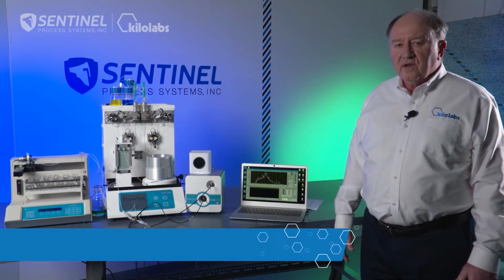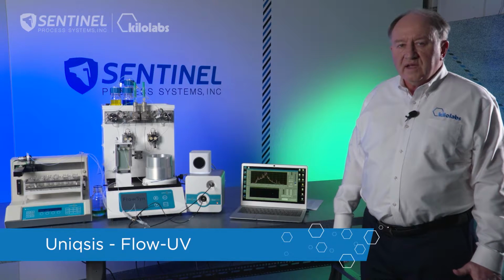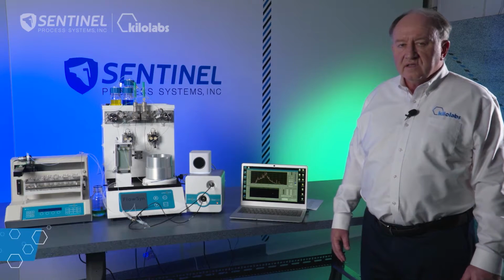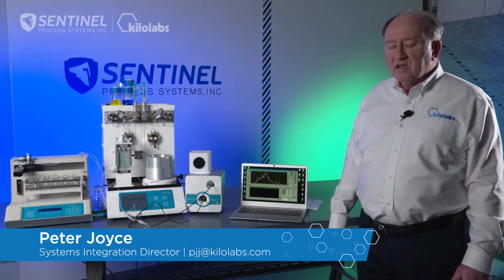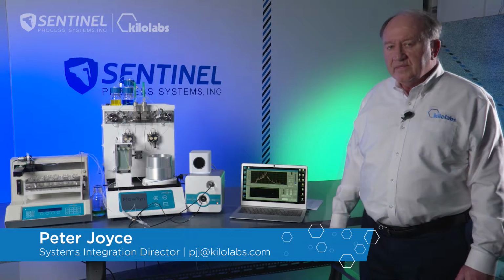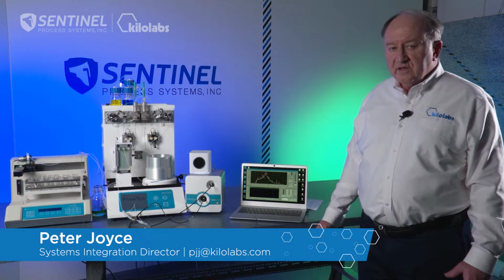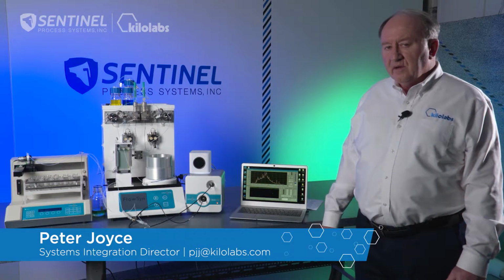This is a Uniqsis FlowUV system. This allows the researcher to look at wavelengths between 200 and 1100 nanometers at high pressure in a flow chemistry system. Thus, the researcher can see the creation of products, the creation of byproducts, or the disappearance of reagents all in one graphical display. The user can also select up to 5 wavelengths and plot those individual wavelengths on the screen, and also be collected in a file for later evaluation.